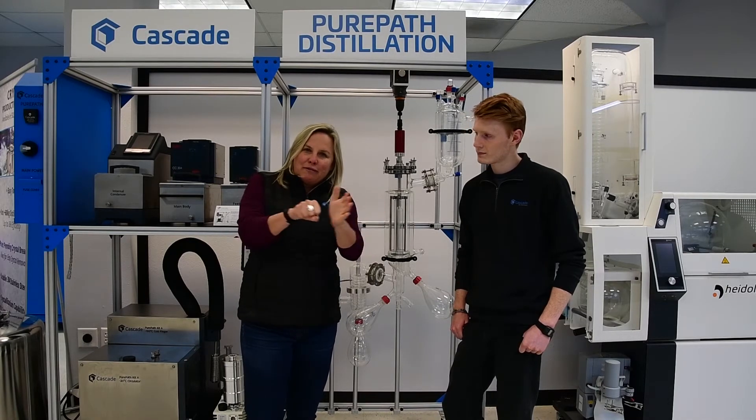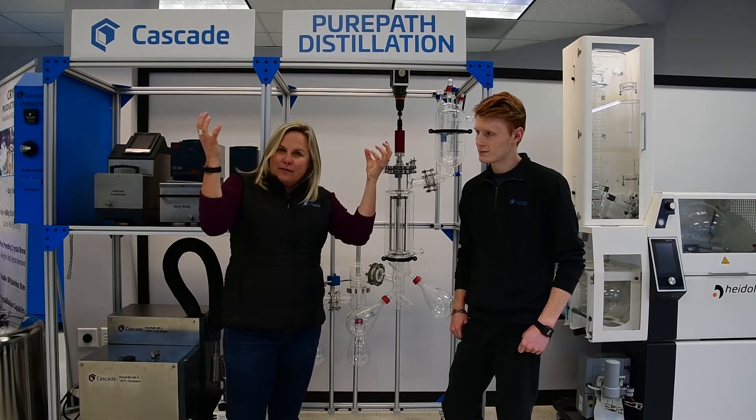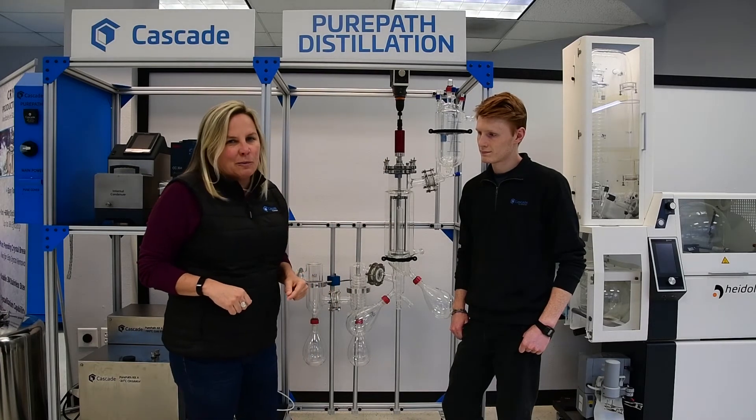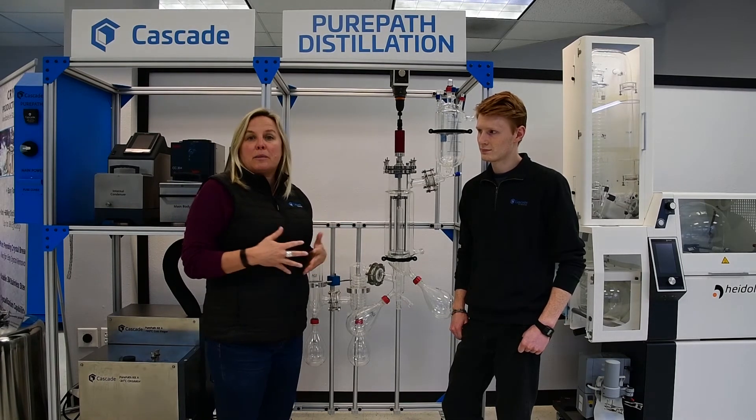Because guess what happens? As soon as you have vacuum grease in there and you introduce some temperature or some vacuum, that grease just melts right into your distillate. So that's no bueno for something that we're making that people are oftentimes going to be consuming.